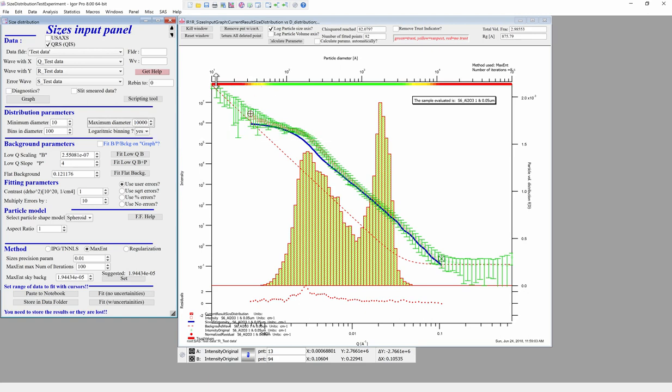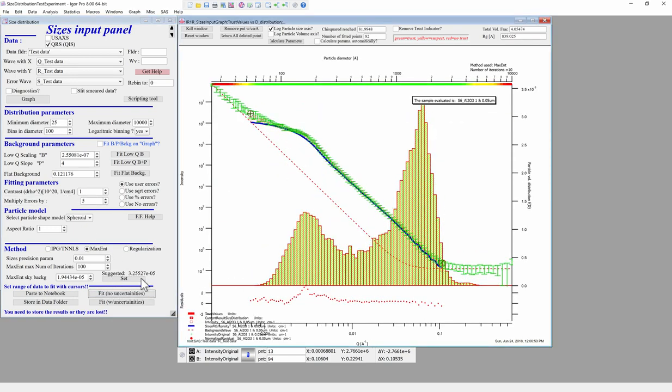And the same thing you can do here. That's 10, 20, 30. So you can see that the Q max where your data are still meaningful here is approximately like 20, 25, and you cannot trust anything beyond that. And then what we can do is we can just take the error bars down and do a fit again. And you can see that it fitted quite well.